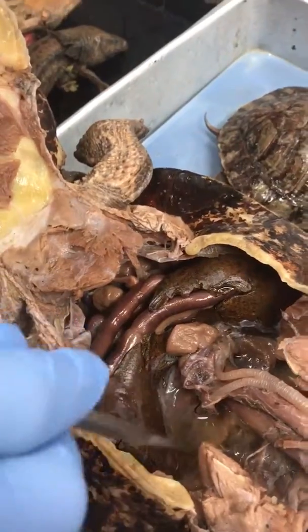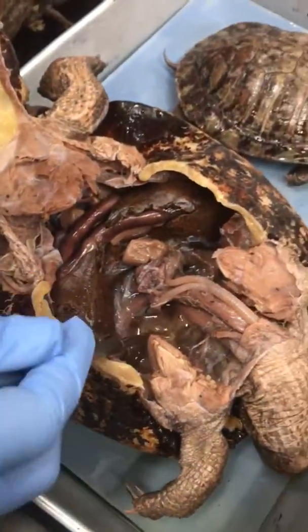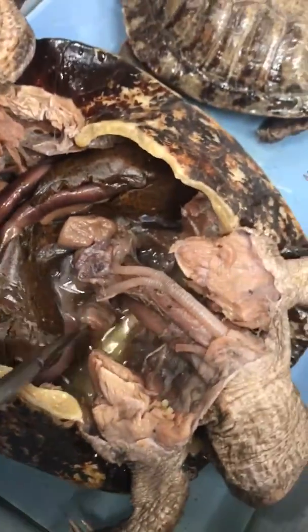And I think that's everything, but for bonus points, that pink fleshy part, that's going to be the stomach. And then there's going to be the lungs back here. They're kind of deflated in the water here.